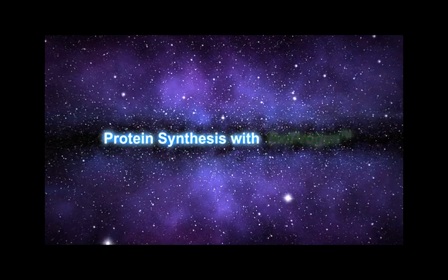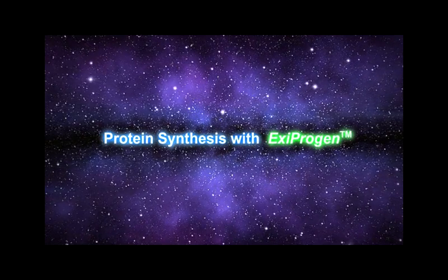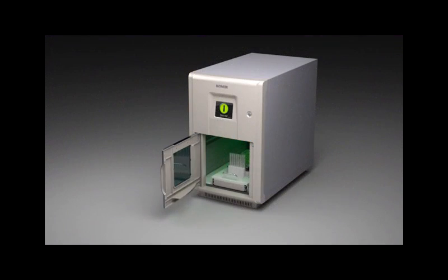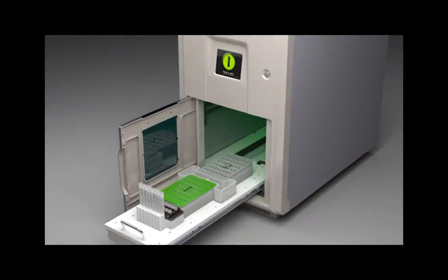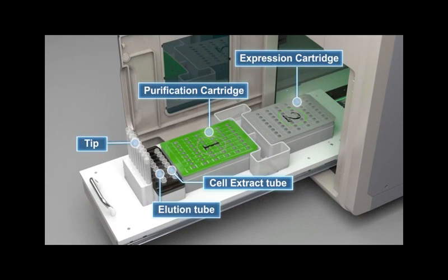Protein synthesis with Exiprogen is started with the setup of the deck. The protein kit consists of an expression and purification cartridge, as well as the E. coli cell extract, plus all the consumables you need.